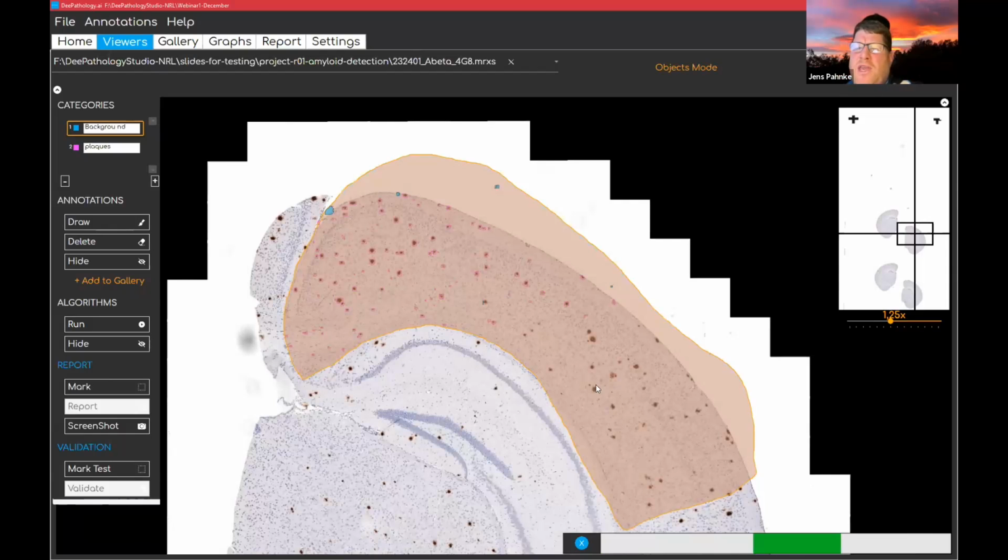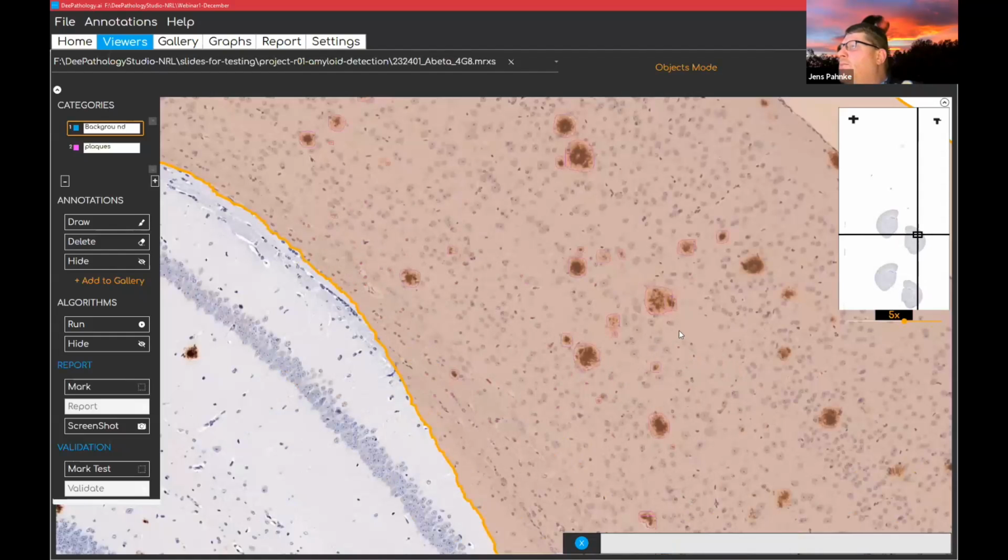In the Excel sheet, you have each of the objects that have been detected labeled with the location, also with the size, and you can use this then in other programs if you want to use it for diagrams. You can also use the objects with the diameter and the location to draw new images and paste them in. That's also possible. So anything you want to do is possible with this.